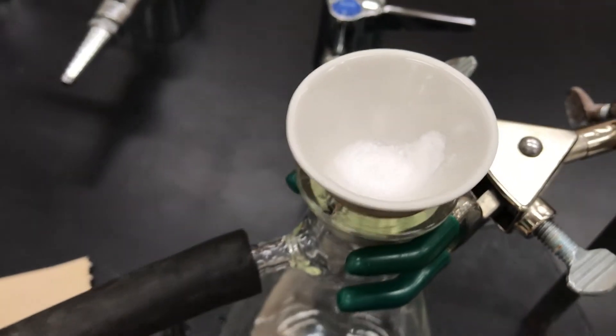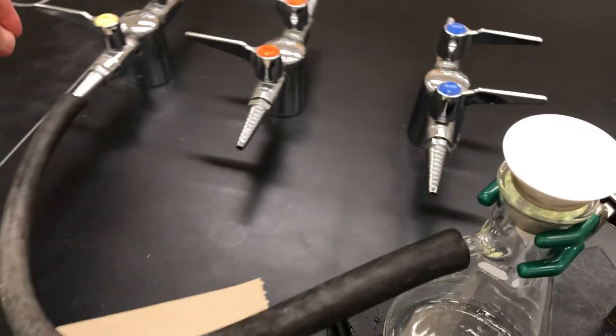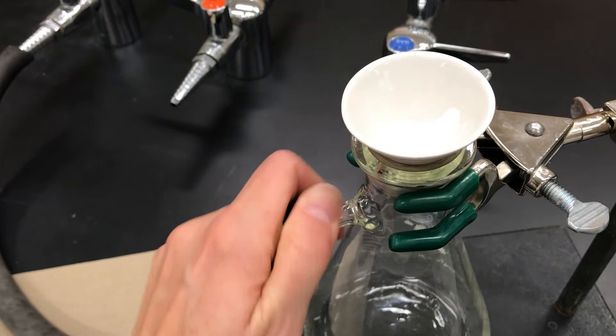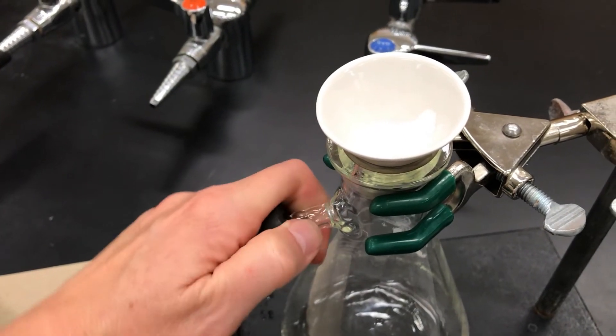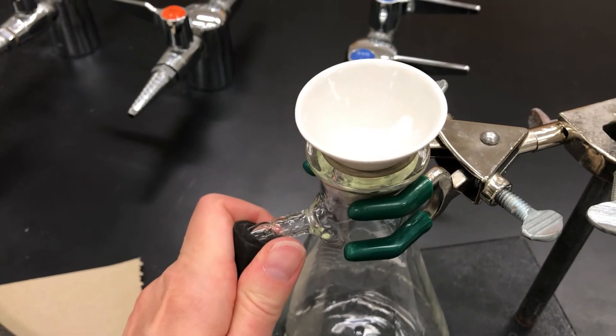When your filtration looks done, you can then turn off the vacuum. Take off the hose to reintroduce the atmospheric pressure into the system. If you wiggle it off, it'll eventually pop off.